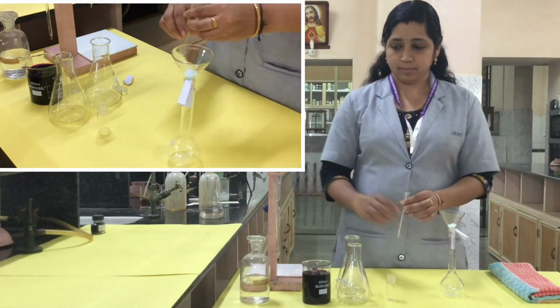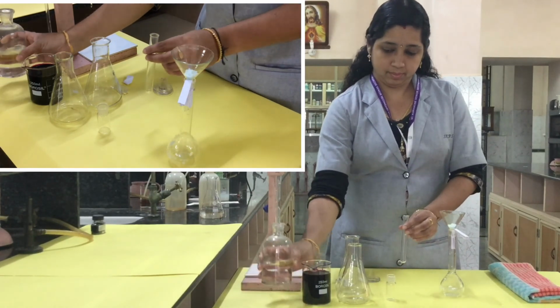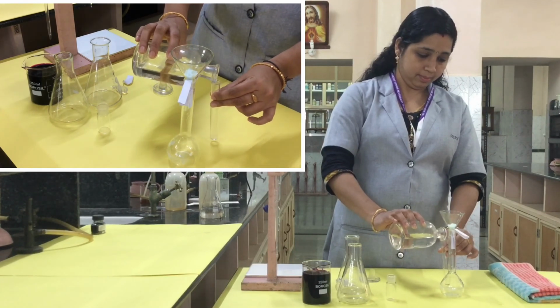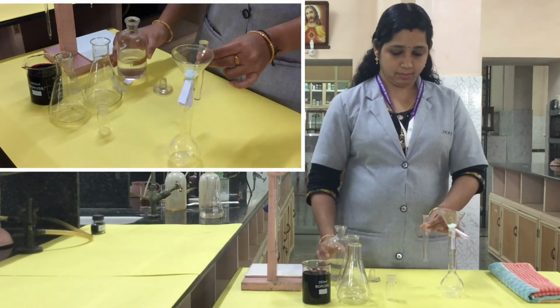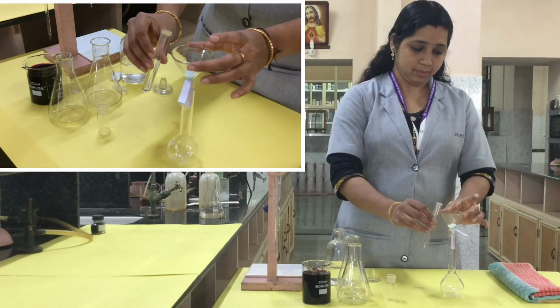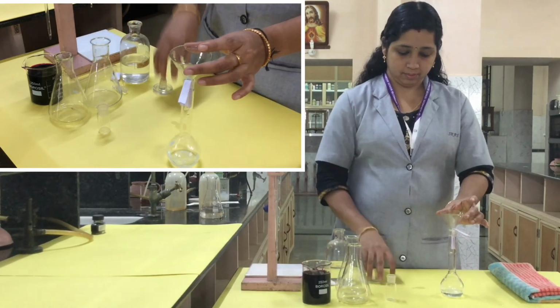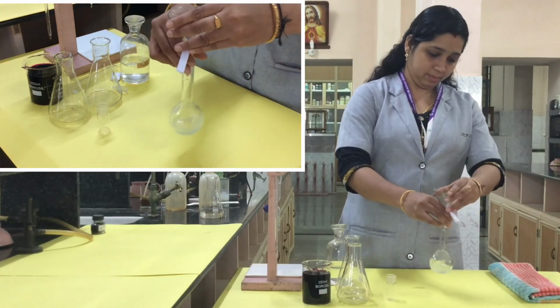Then add one test tube of dilute sulfuric acid to this. Dilute sulfuric acid, one test tube full of dilute sulfuric acid. Add it to this Mohr salt. Just add this one test tube full of sulfuric acid. Then just shake.